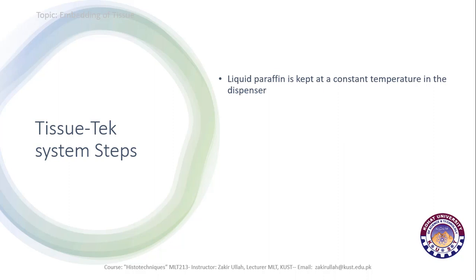Multiple steps are performed by this tissue tech system for embedding of the tissue. First, the liquid paraffin is kept at constant temperature in the dispenser.